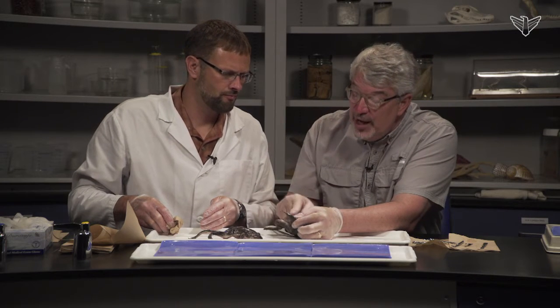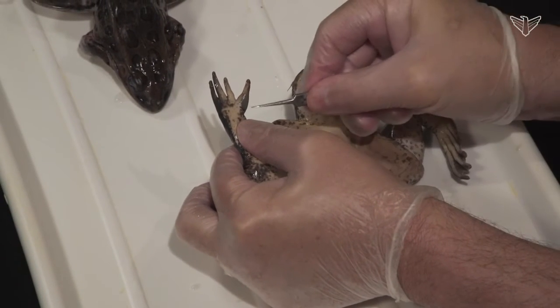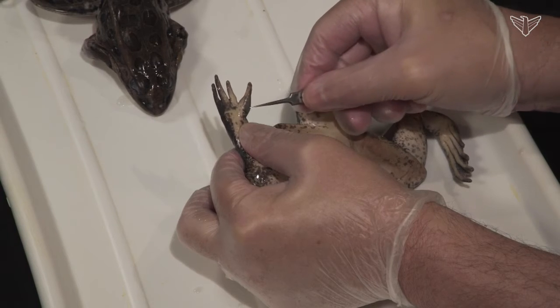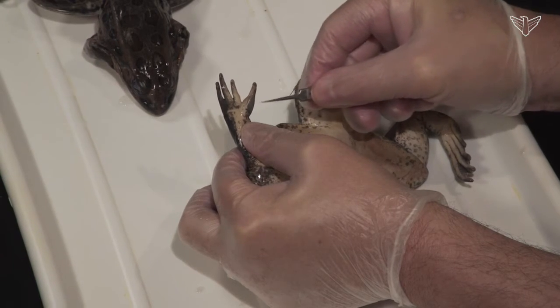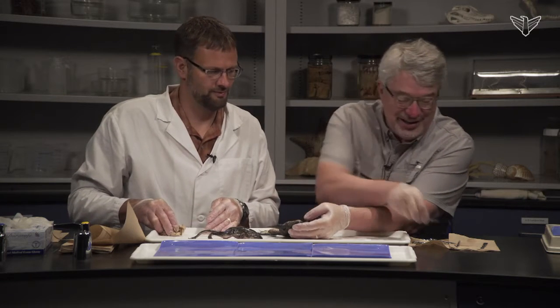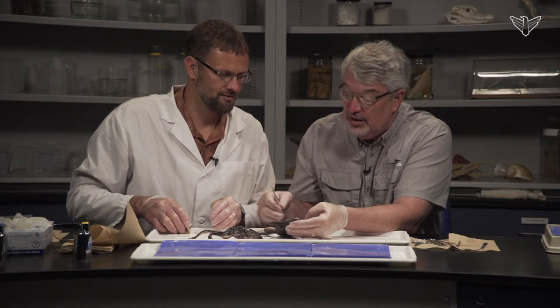But the males have a slightly swollen base of the thumb there. You can see this structure right here, probably for attaching to the female or holding onto the female during mating. We assume maybe a male here then? So I would assume this one's a male. We'll get a shot to tell you. Once you look externally or internally, then of course you can tell.